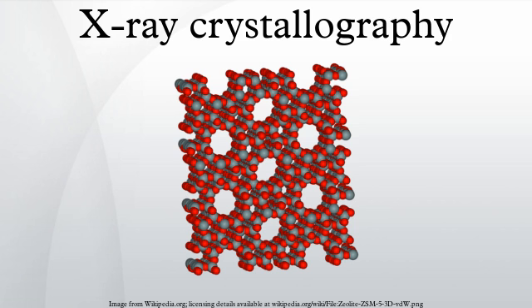However, this works only if the scattering is weak, that is, if the scattered beams are much less intense than the incoming beam. Weakly scattered beams pass through the remainder of the crystal without undergoing a second scattering event. Such re-scattered waves are called secondary scattering, and hinder the analysis. Any sufficiently thick crystal will produce secondary scattering, but since X-rays interact relatively weakly with the electrons, this is generally not a significant concern. By contrast, electron beams may produce strong secondary scattering even for relatively thin crystals.